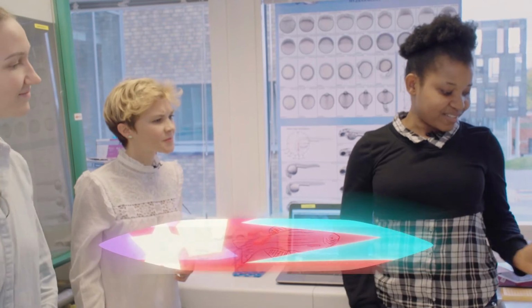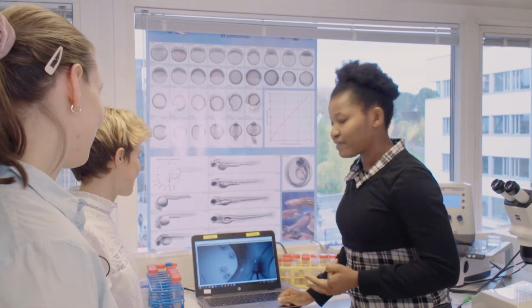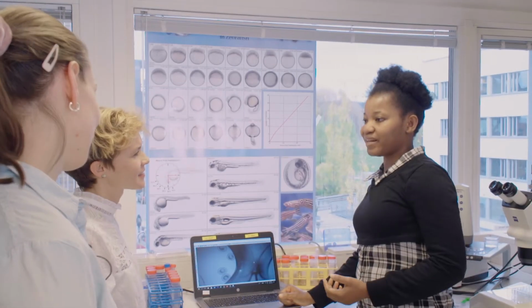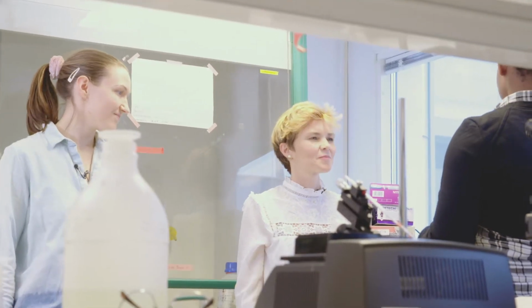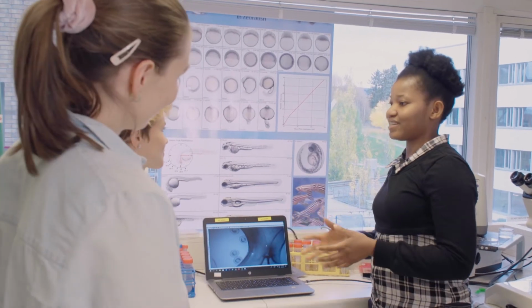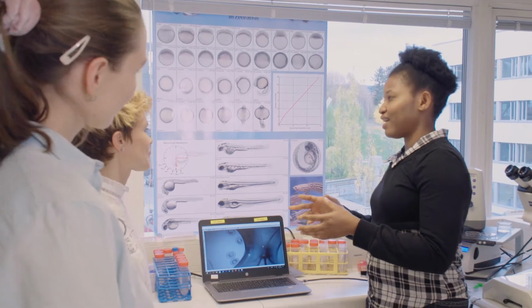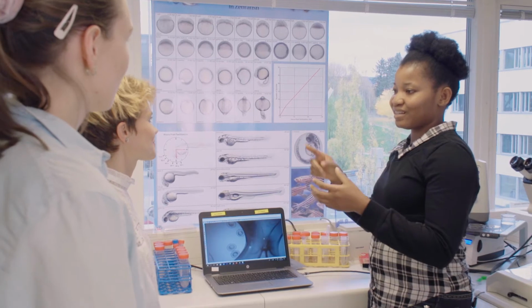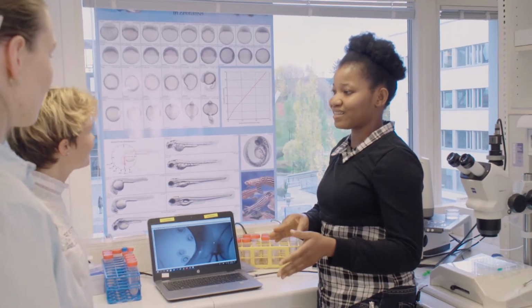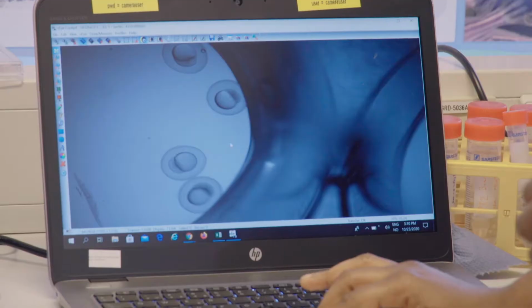So under the microscope, I have embryos that were born today. They were born about 3 hours ago. For zebrafish, after like 30 minutes, they already start going through cell division. So at 30 minutes post-fertilization, usually you have the one cell stage. And then about every 15 minutes, you see duplication of the cell. So from one cell stage, you have 2 cell stage, 4 cell stage, and so on.